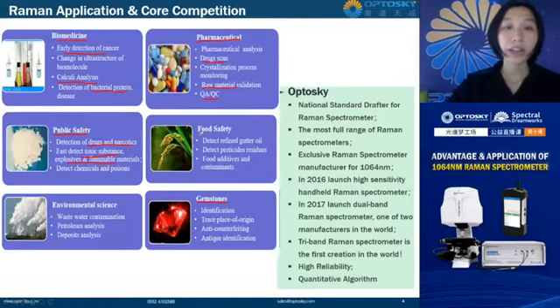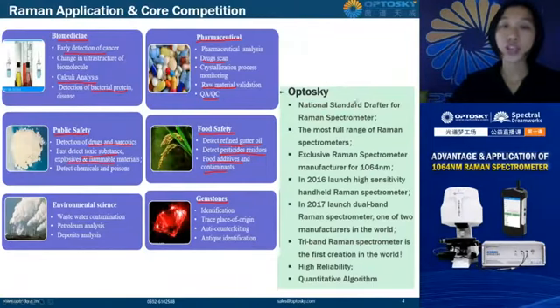They are also used in food safety to detect pesticide residues, food additives and contaminants. It is also used to detect refined gutter oil, which is notorious in China. And they are used in water quality contaminant analysis, petrol analysis, and deposit analysis. Raman spectrometers have so many applications.